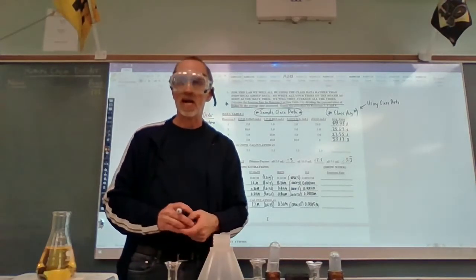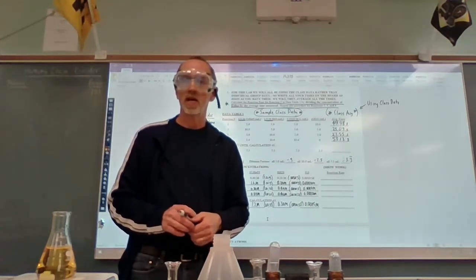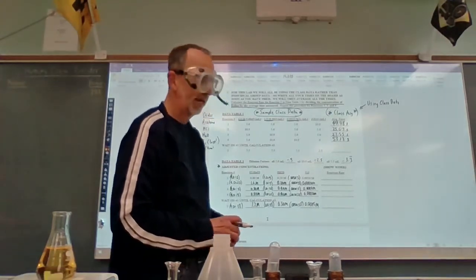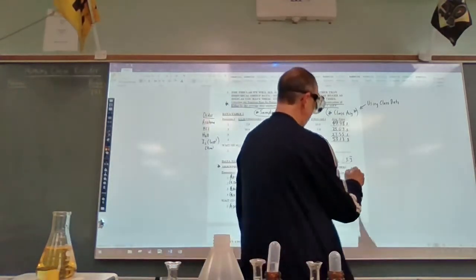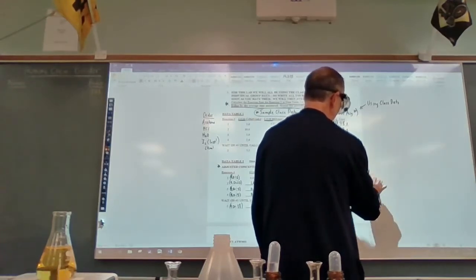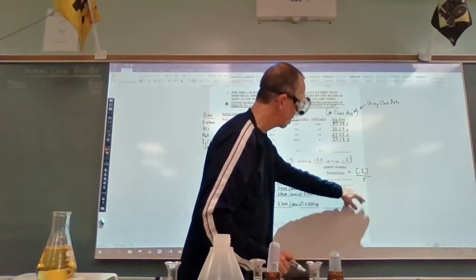Iodine is the clock, and so again, we're going to be utilizing its concentration as our benchmark for determining reaction rate. So then the rate would be the iodine concentration over T, all right? Yes, it's not really delta T, it's just T.